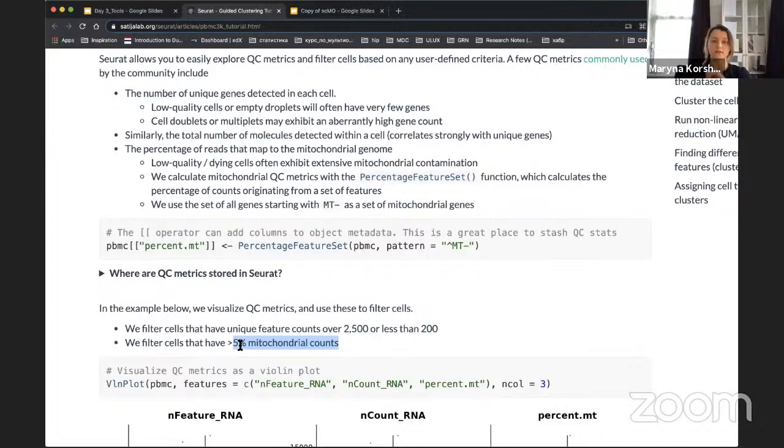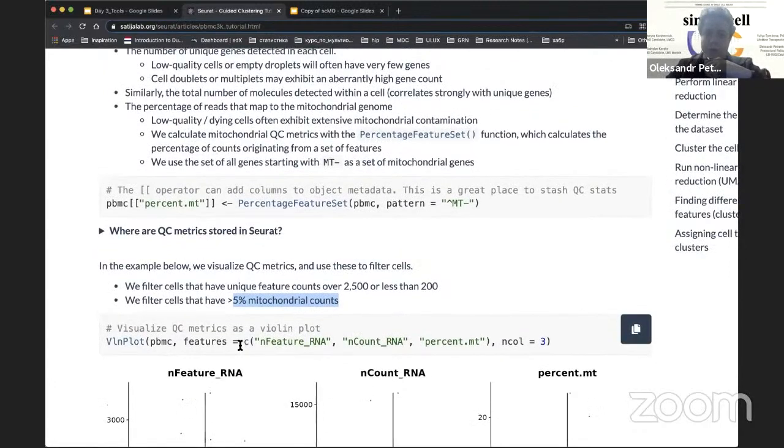to not exclude some important and informative cell data. So Marina, just out of curiosity, when we're speaking about the filtration based on the mitochondrial content, as we previously discussed, it's very tissue specific, right? And as I understood, you are mostly working with either primary cells, PBMCs, so from blood, or with neuro data sets, I would say. So could you tell which filters, which threshold do you usually use for that?